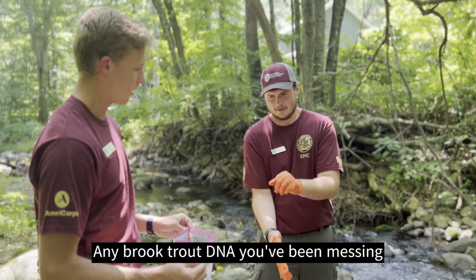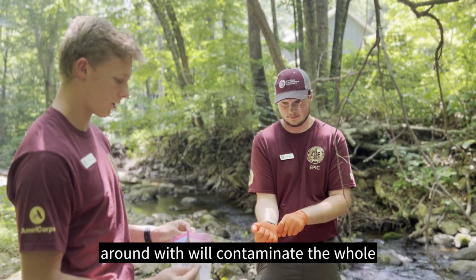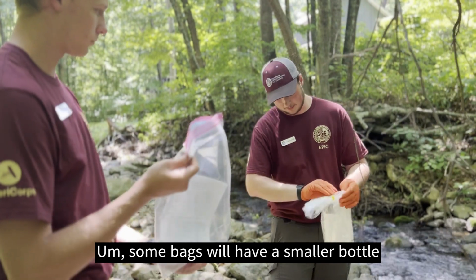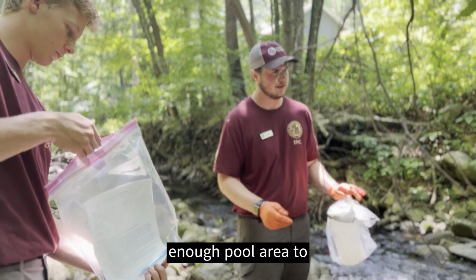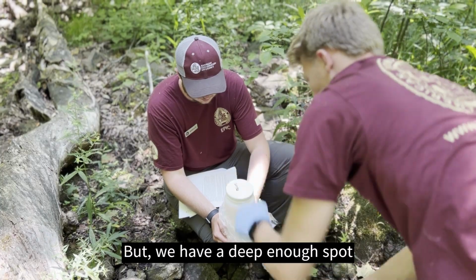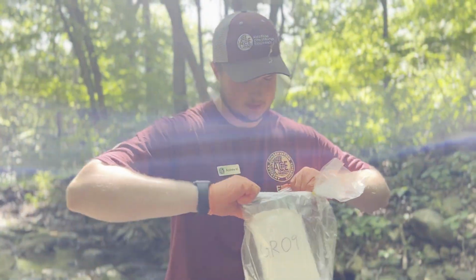Put them in. Any brook trout DNA you've been messing around with will contaminate the whole thing. Just grab the bottle out. Some bags will have a smaller bottle in them in case you can't get a deep enough pool area to get a sample, so you take the small one and just fill up the big one with it. But we got a deep enough spot where we could fill this up.